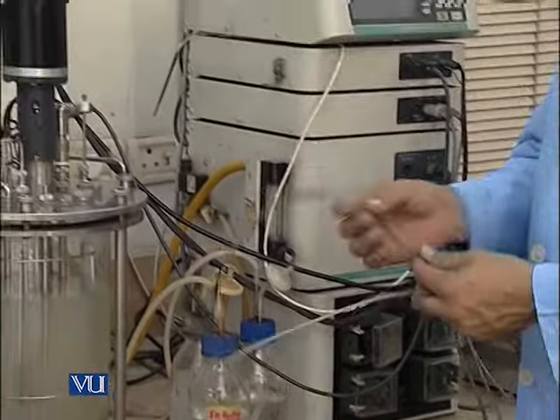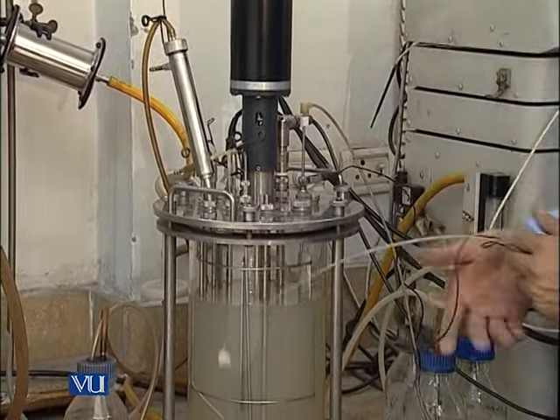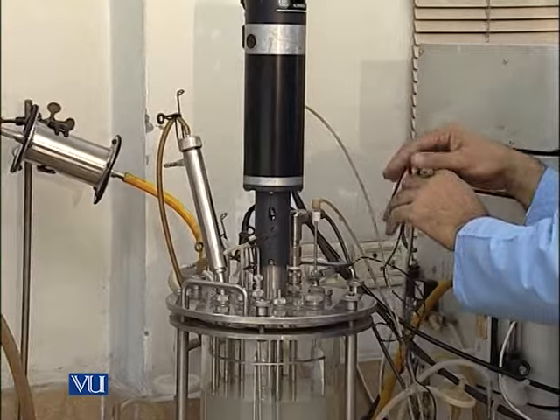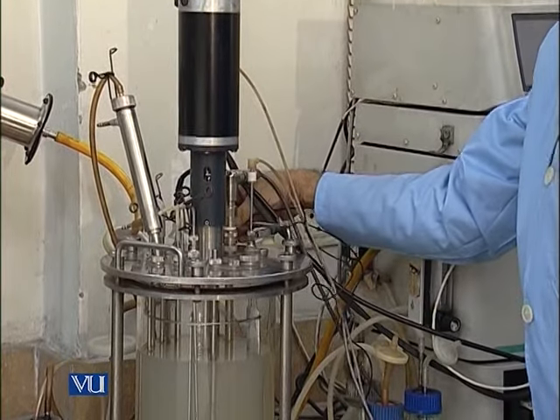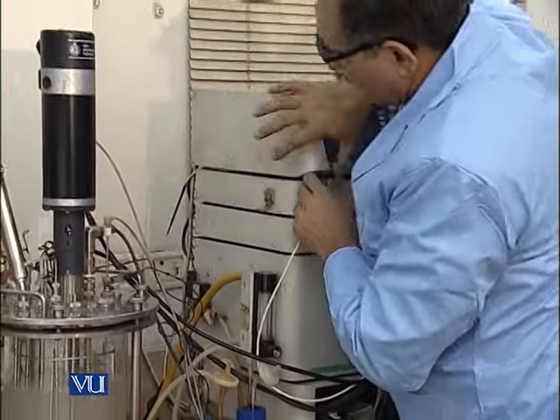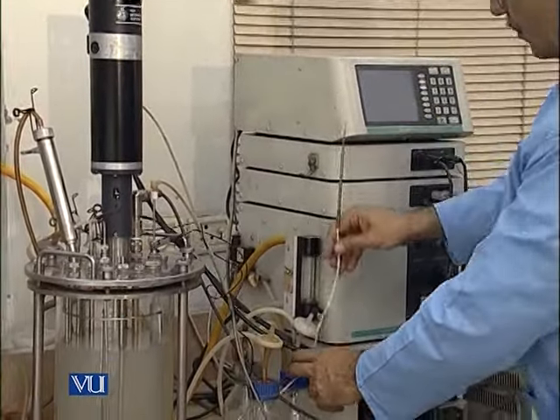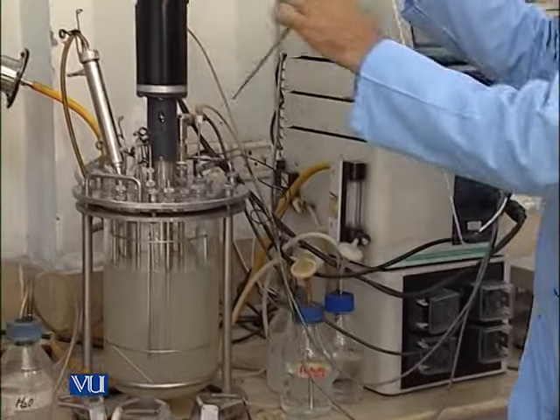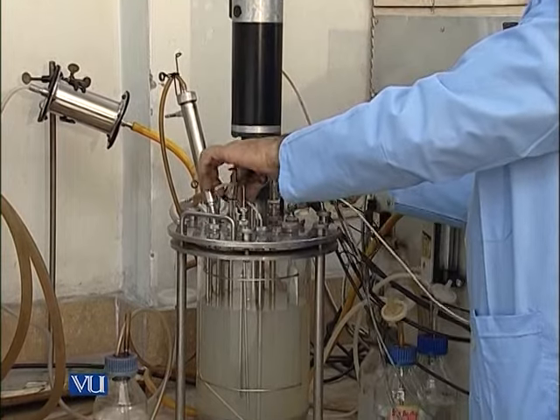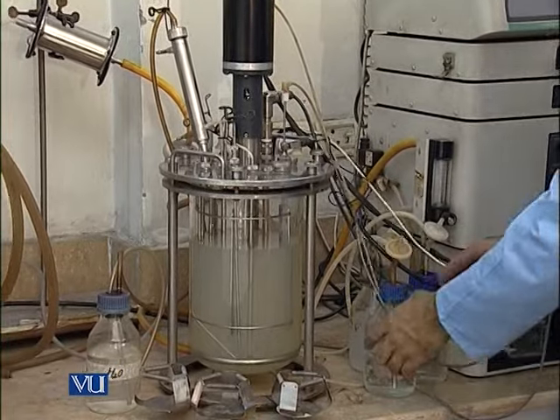As concerned the wet on and wet off, we have this, and then the sensor the same way here, and then this, and then a temperature probe. It is a PT100 probe, and we will add it here. You can see here, these are the three.